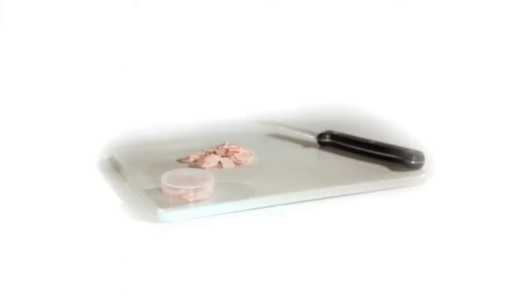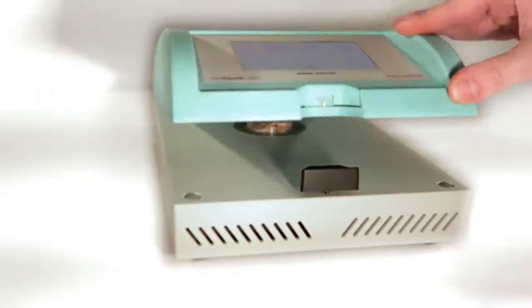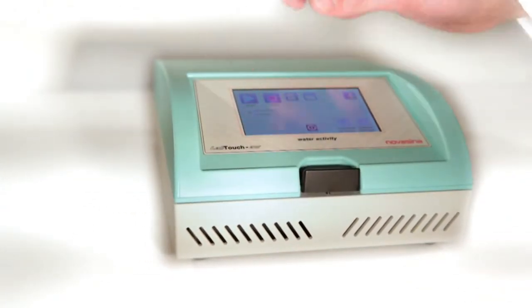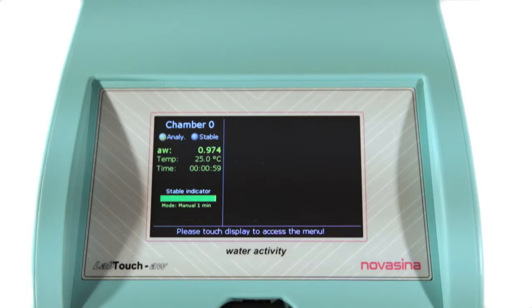The sample is filled in a disposable cup and put inside the temperature-controlled measurement chamber. After starting the measurement, a bar indicator shows the measurement's progress. Once stability is reached, the water activity value is shown on the display.